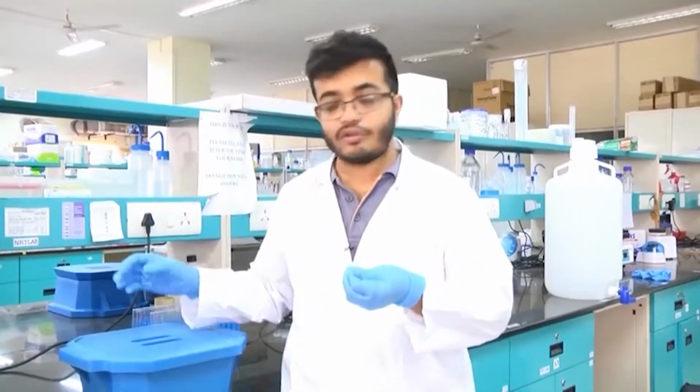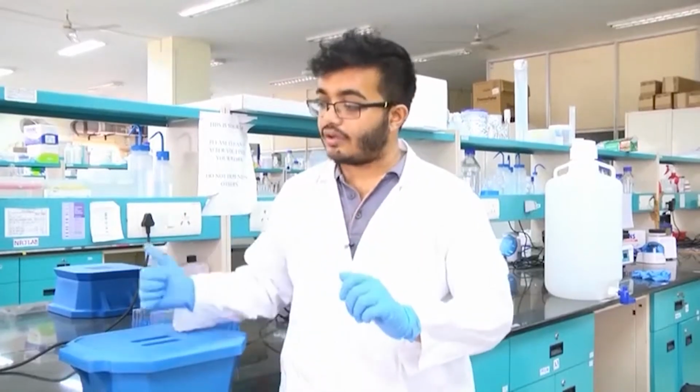We keep them for around 5 minutes. You can keep them for 2 to 10 minutes. I usually prefer to keep them on ice for 5 minutes to help the bacterial cells recover. After that, we add some nutritive media. I will use LB media. We add some LB media and allow these cells to grow for 1.5 hours at 37 degrees centigrade.